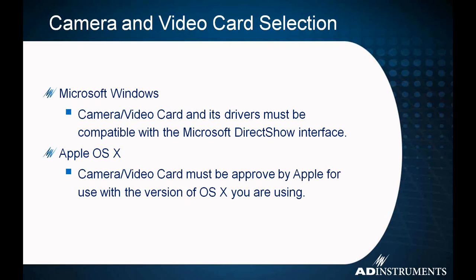If you're using the video capture module in Windows, you definitely need to have a video card or camera that is compatible with Microsoft DirectShow. Anything else will not work. And like I said, also make sure it's a quality video card and camera. Any of the gray market stuff floating around out there may be cheaper, but drivers and actual operating software for the camera are not all created equal. So definitely go to a reputable company.